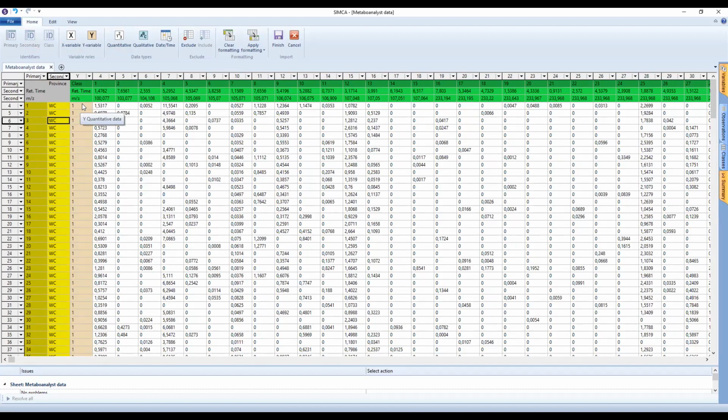So depending on your scenario, you can have a classification based on the sample, the species. In the previous example, we could have used 4 classes where the one ginseng is given a class and then another one, another class. You can use treatments, or in terms of biological activity, the active samples can be assigned a class of 1, the non-active samples can be assigned a class of 2, so that you can correlate the chemical profiles to the biological activity that you're observing. Okay, now in this case, we want to be able to correlate the chemical profiles to the geographical location of the samples of the plants.